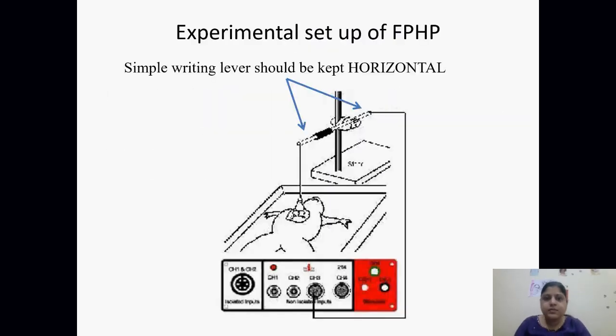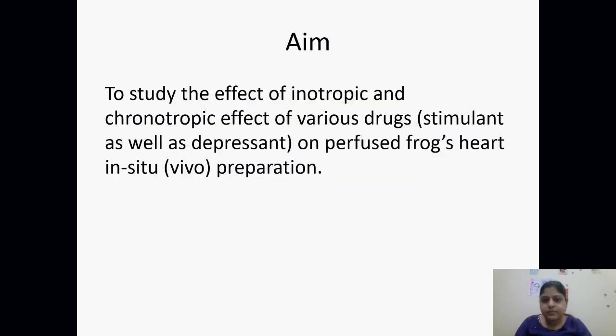So next is the experimental setup of the frog perfused heart preparation. This is how the frog perfused heart preparation is set up.